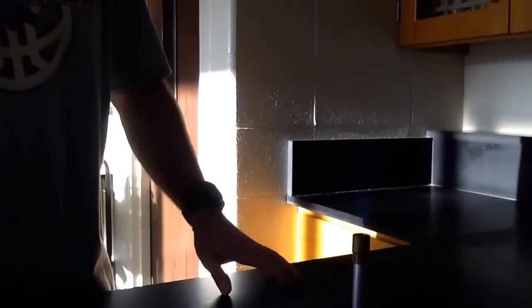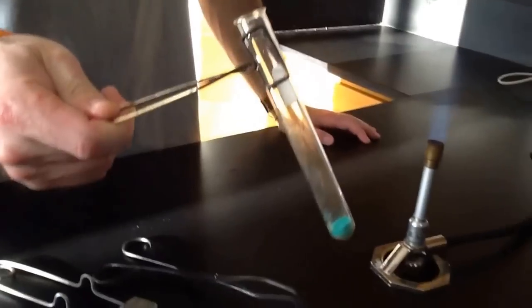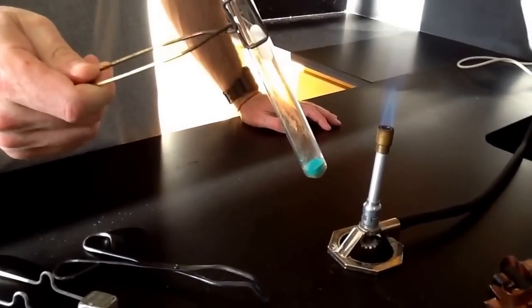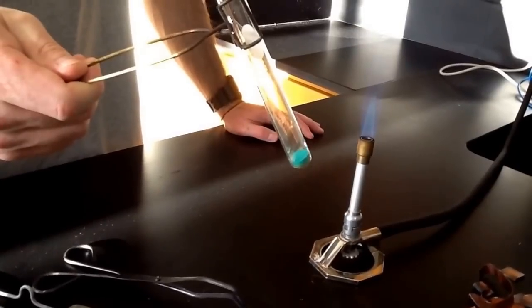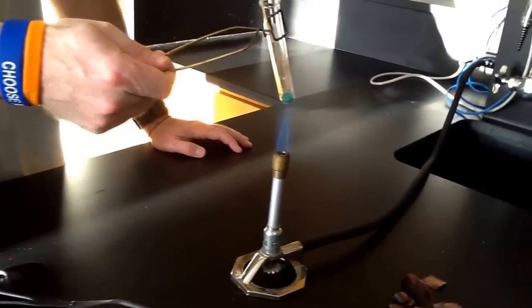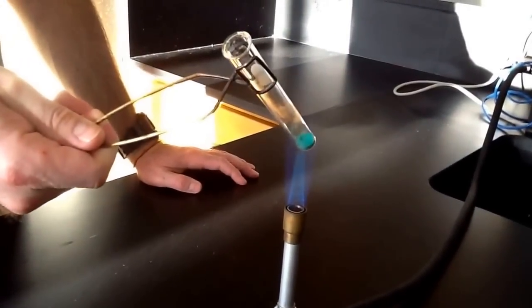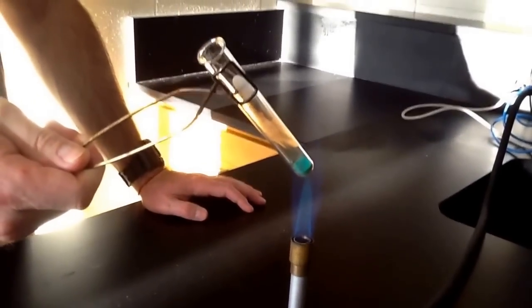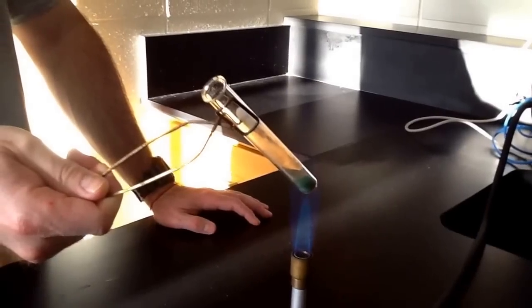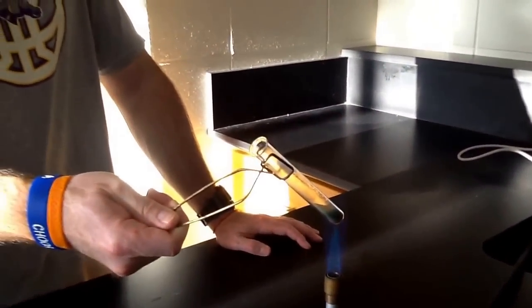All right. Next reaction we're going to show you is a reaction of copper carbonate. Okay, copper carbonate is a nice green powder, and we're going to heat it up. Now in this case, this is a decomposition reaction. So we're just taking one reactant and we're going to heat it up and decompose it. Whenever you're heating something up on the Bunsen burner, you want to point the mouth of the test tube away from anybody. Okay, that's just a good thing to do.